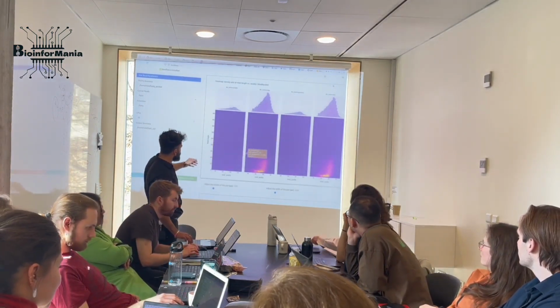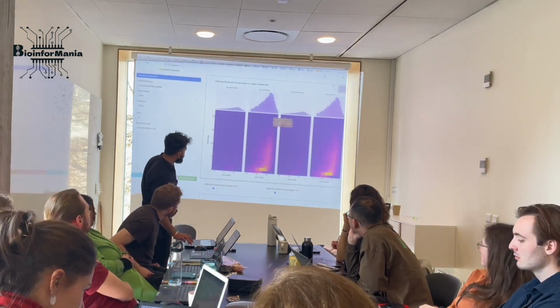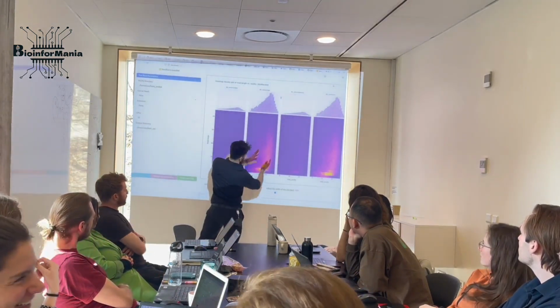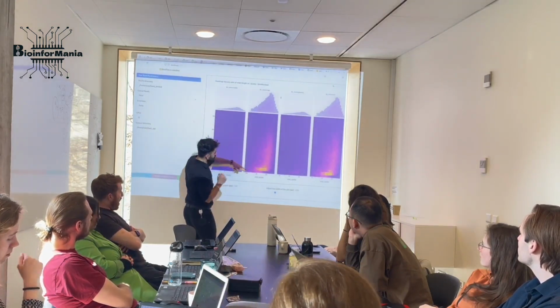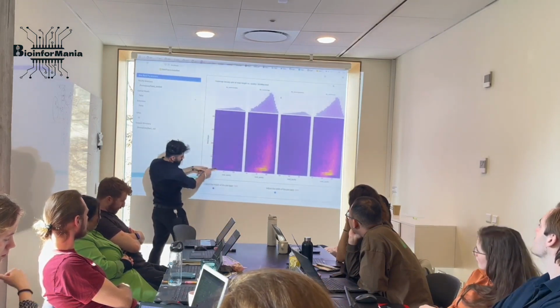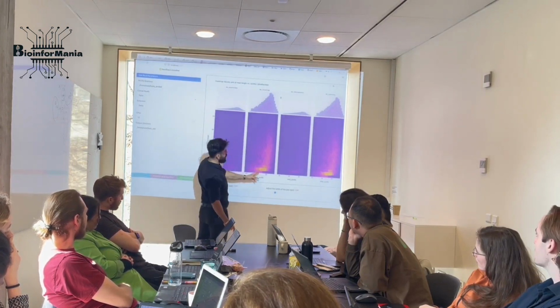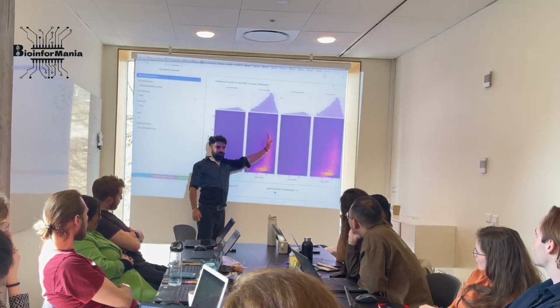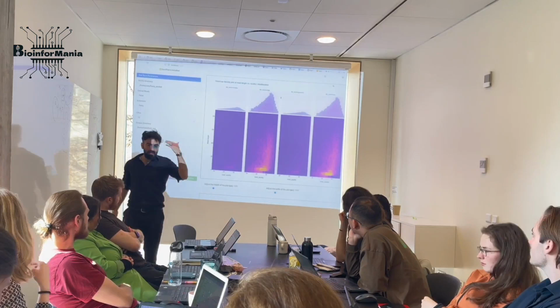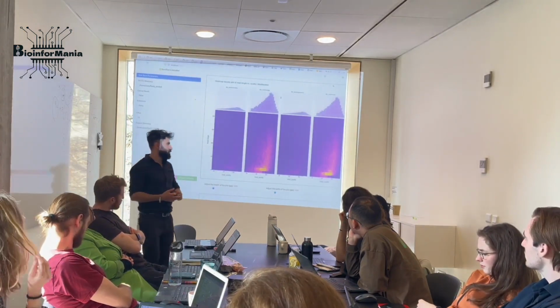And if you go down to this density heat map and zoom in a little bit, you can see this flame of fire is not necessarily growing, you see? So length doesn't necessarily have anything to do with that. It has for the low reads from here, but at some point it peaks, so no matter how long the read becomes, the quality doesn't actually change. See what I mean? So this is also great news, like Oxford Nanopore Technology. No matter about short or long read, it can give you high quality results.